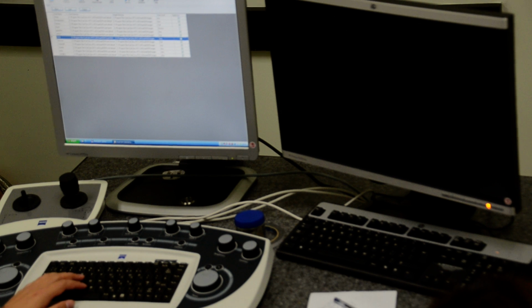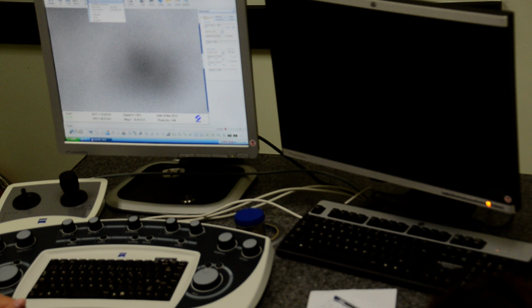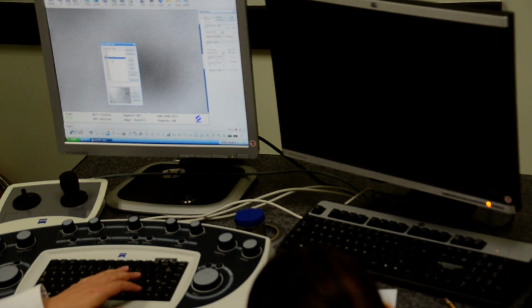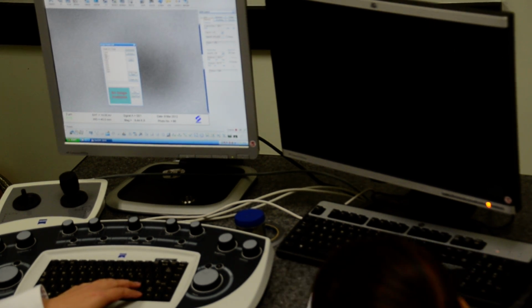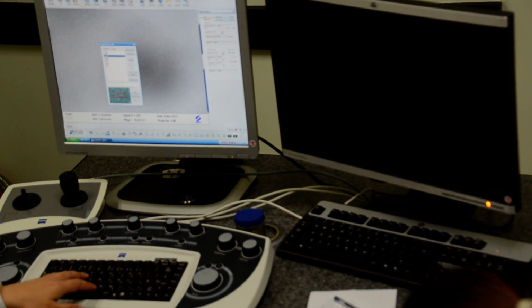Okay, so reset. Yeah, maybe something will copy from here. So this is something that doesn't belong. You just delete all of them, and delete all one by one.